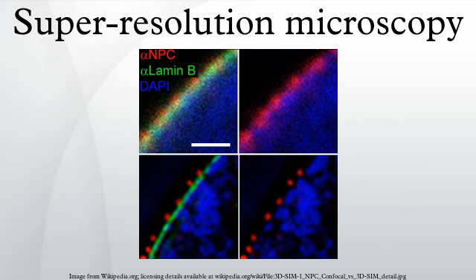Super-resolution techniques allow the capture of images with a higher resolution than the diffraction limit. They fall into two broad categories: true super-resolution techniques, which capture information contained in evanescent waves, and functional super-resolution techniques, which use clever experimental techniques and known limitations on the matter being imaged to reconstruct a super-resolution image. True subwavelength imaging techniques include those that utilize the Pendry superlens and near-field scanning optical microscopy, the 4-pi microscope, and structured illumination microscopy technologies like SIM and SMI. However, the majority of techniques of importance in biological imaging fall into the functional category.